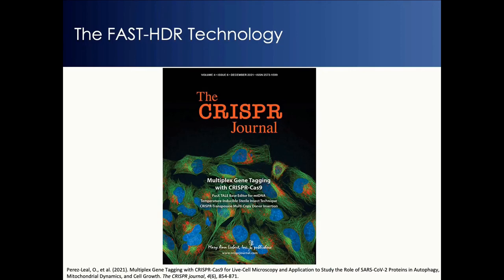We reported the FAST-HDR technology in the CRISPR Journal last year in December, and we were featured on the cover of that month due to our capability to do this multiplex gene tagging with CRISPR. And the reference is here at the bottom.